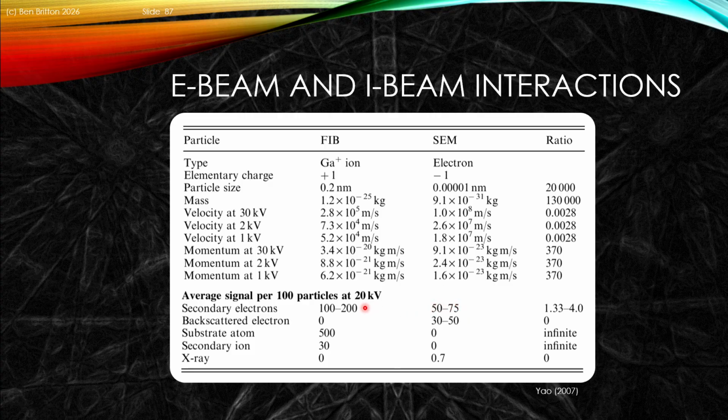We actually also get a huge number of secondary electrons generated from our FIB. So although I argued that a huge amount of the ion-based build-up of the deposition layer is related to ion-matter interactions, the secondary electron generation for the ion interactions is also likely important.